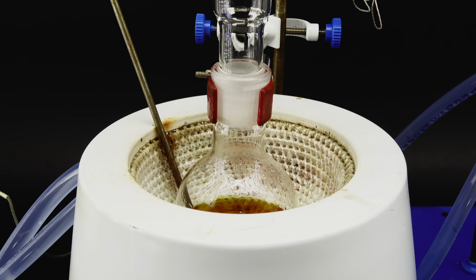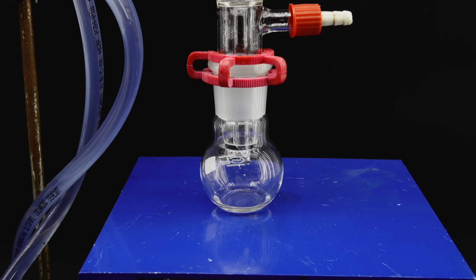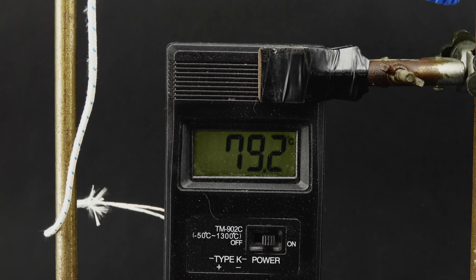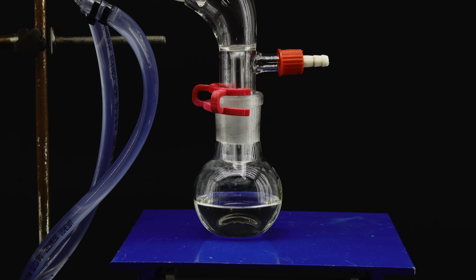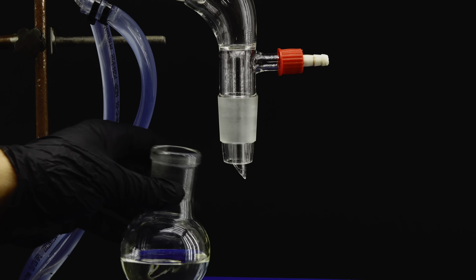To make up for all the struggle, this distillation was just textbook, with some beautiful, clear benzene coming over at nearly exactly its boiling point. There was also quite a bit of it which was beyond cool, and when the inside of the boiling flask got too tarry for my liking, I stopped the heating and recovered my product.